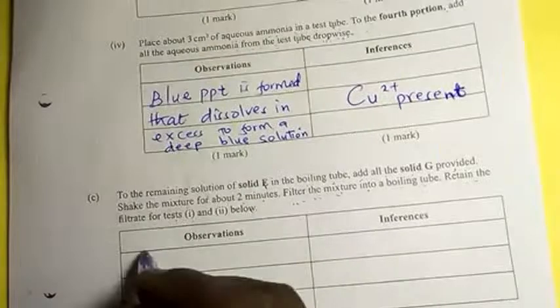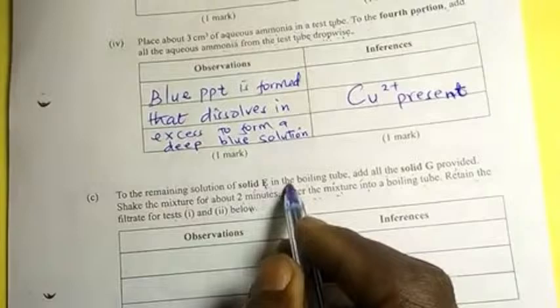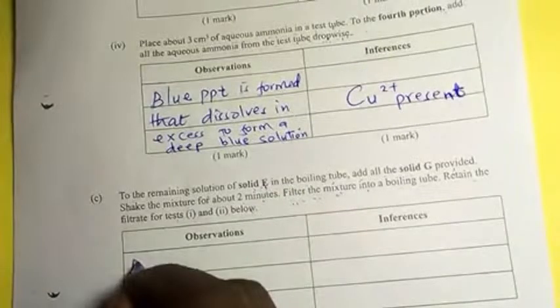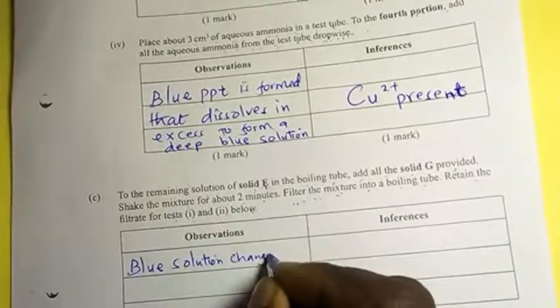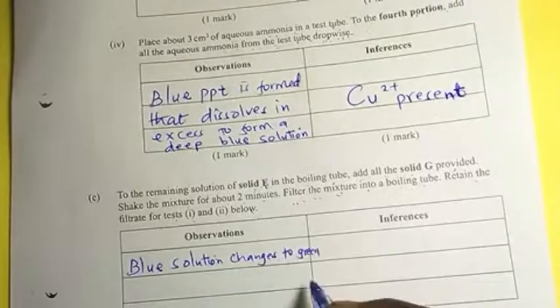So a blue solution, remember the blue solution. The observation is that the blue solution changes to green.